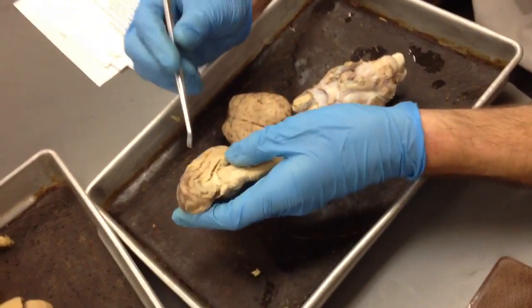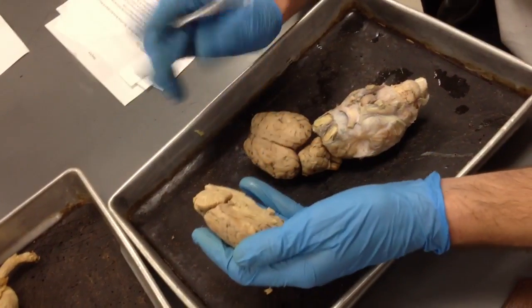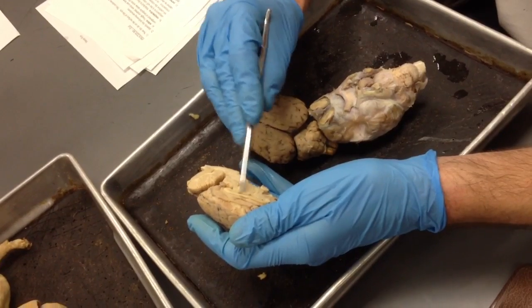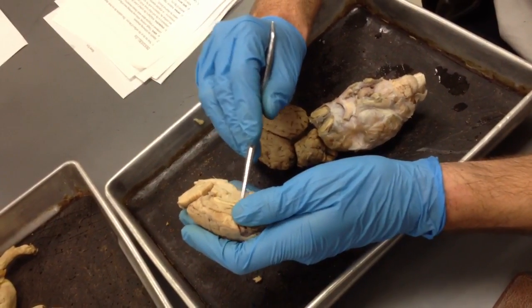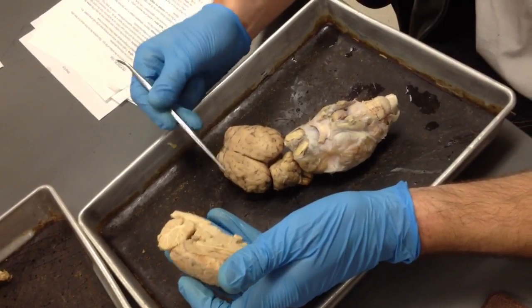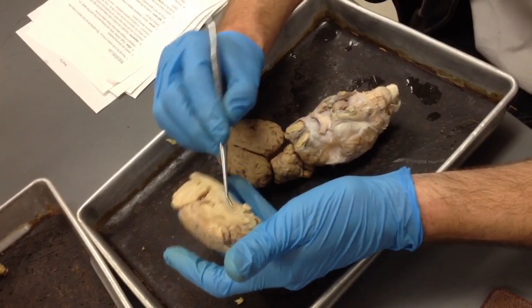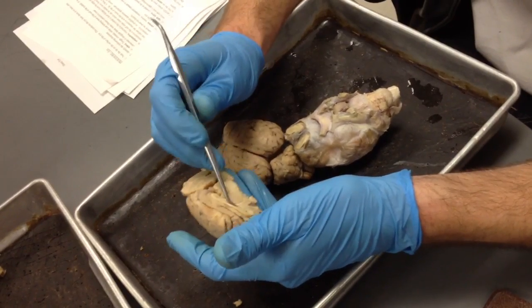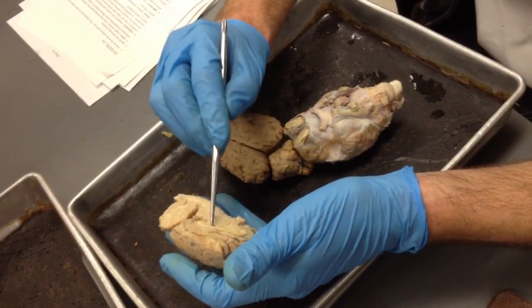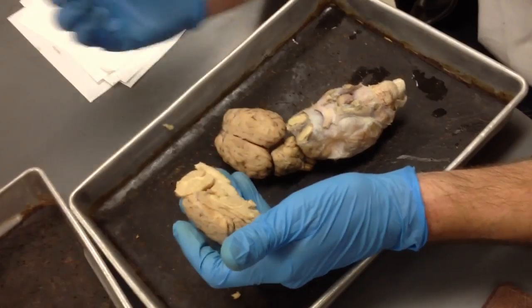Corpus callosum, remember, is this nice white structure. Okay. And it's continuous with the fornix, which is going to be the ventral part, which creates the lateral ventricle in the center. Each hemisphere has one because they're separated by the septum pellucidum. That's the one that you guys do not need to identify. There's only a little shard of it left here. So, but you do need to know that the lateral ventricles of each hemisphere are separated by the septum pellucidum.